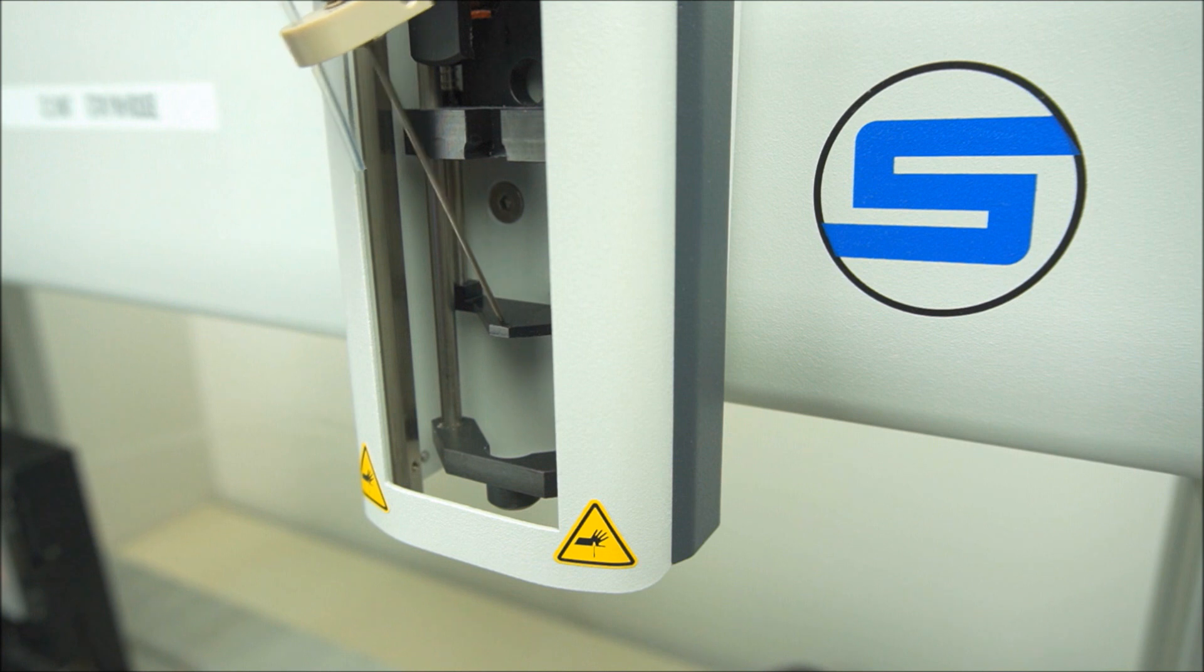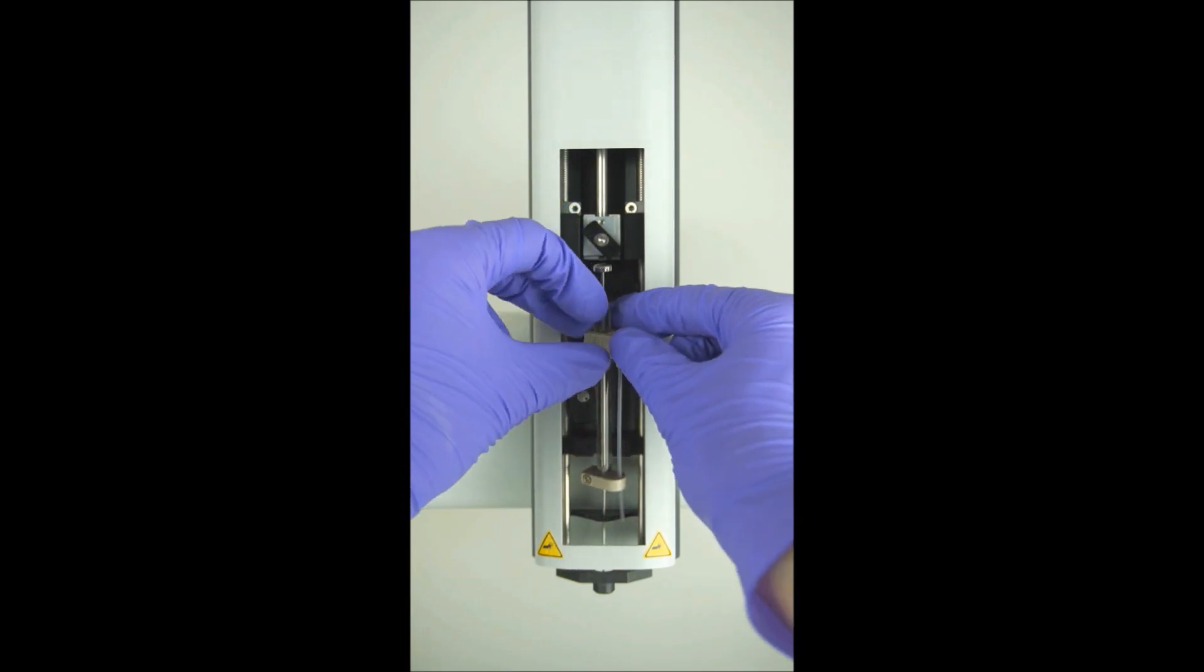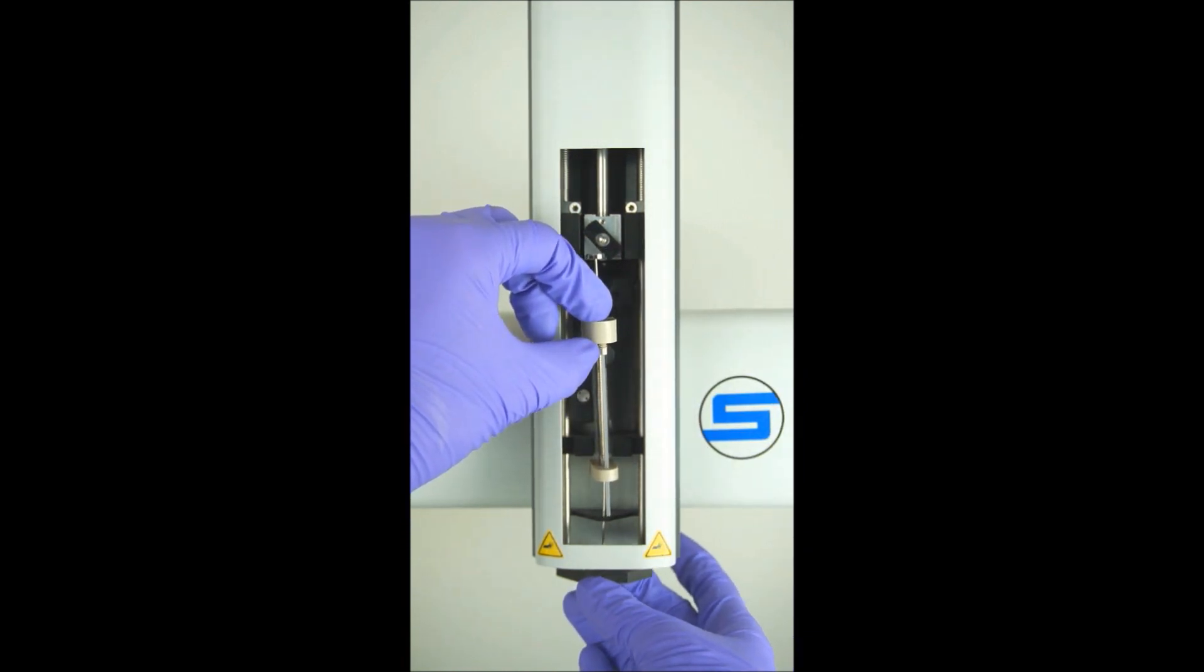To install an auto sampler syringe, thread the needle through the upper needle guide down to the top of the lower guide. Align the plunger with the upper clamp and open.